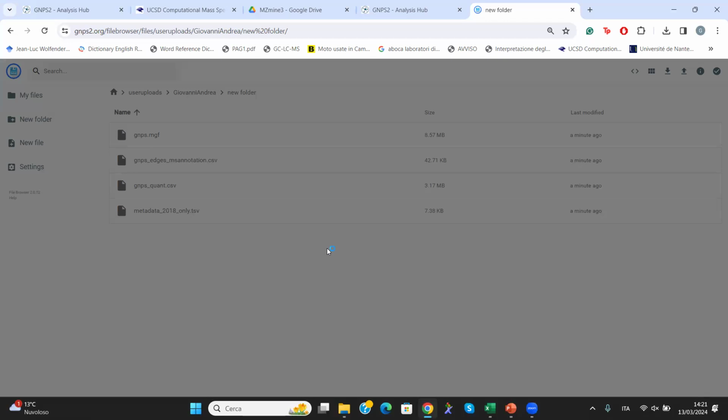So you need the token to have an account right now. But at some point it will be opened up, and if you have collaborators that need one, they can do it anyway, but you, the main developer. Is everyone in?